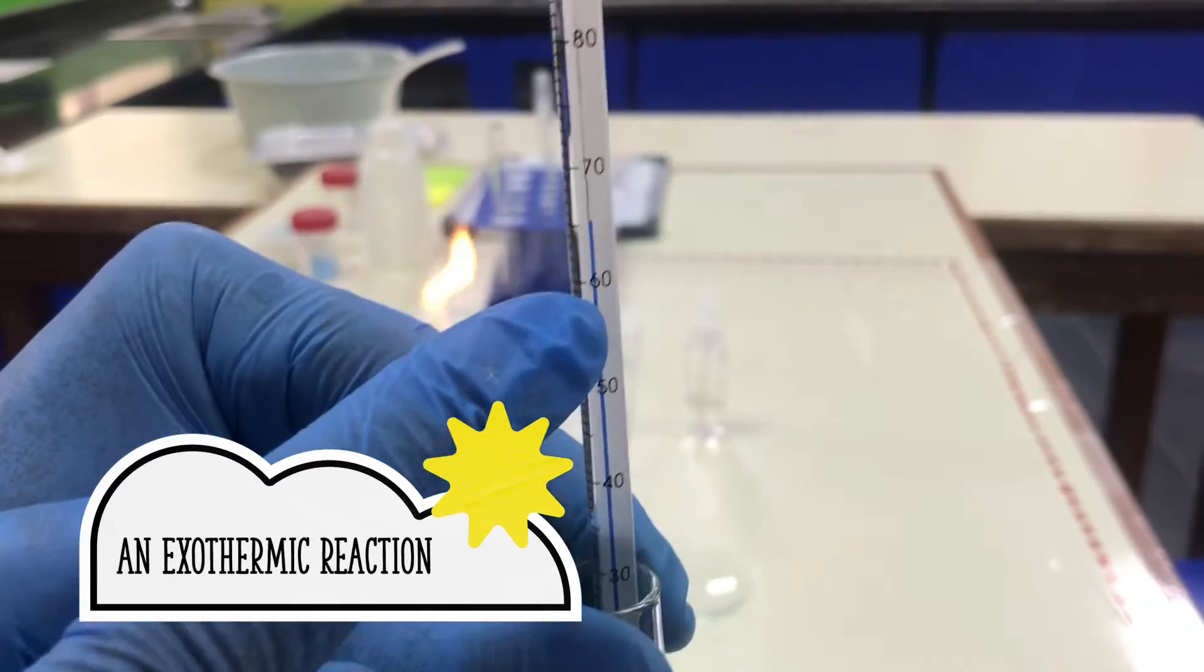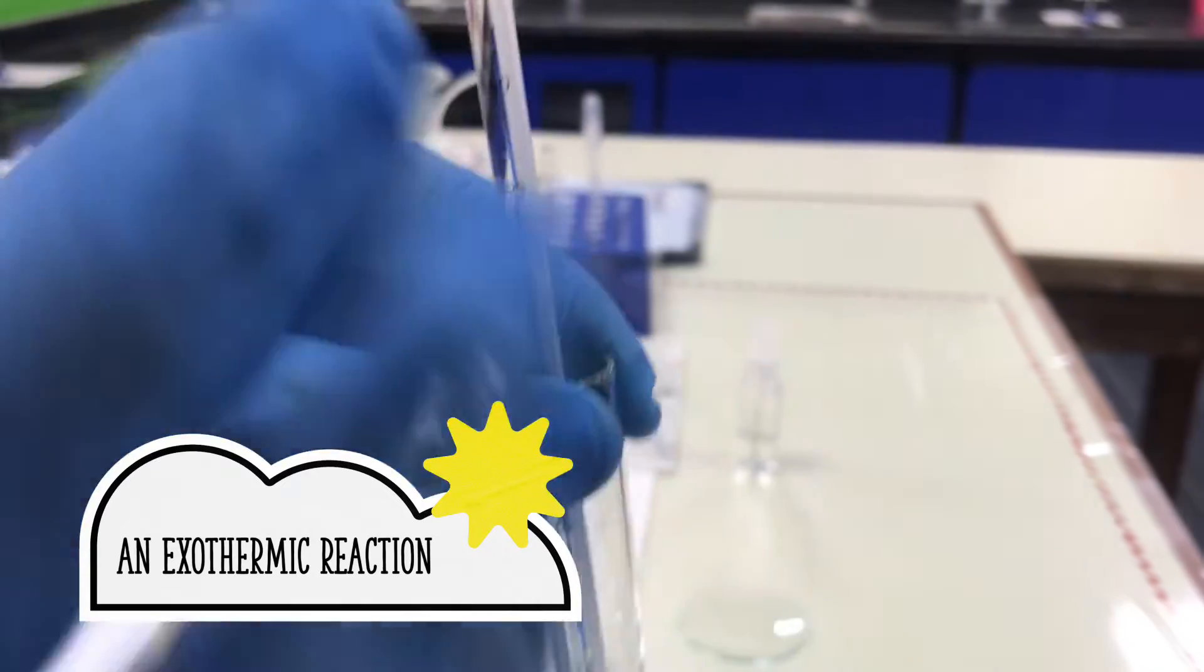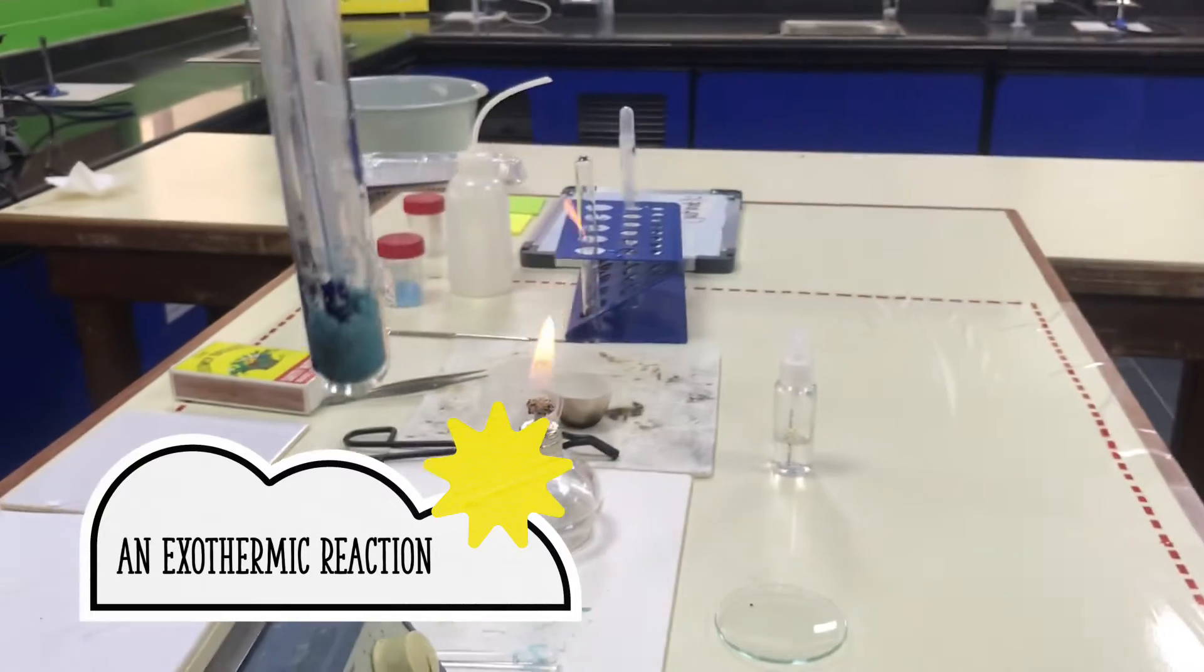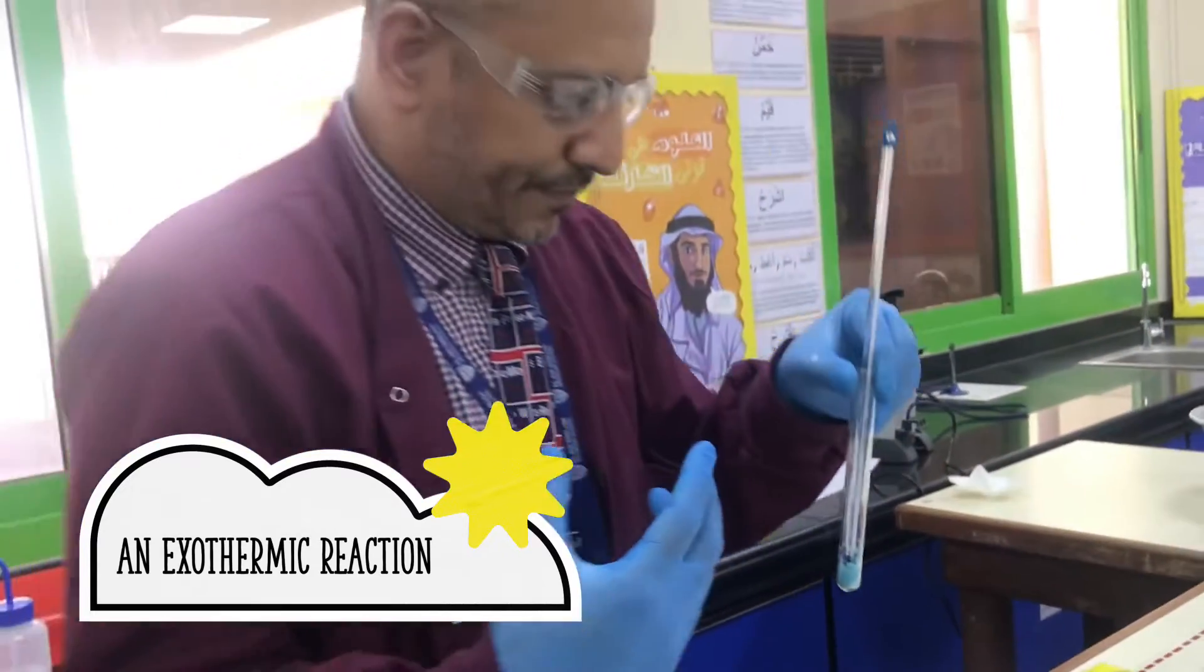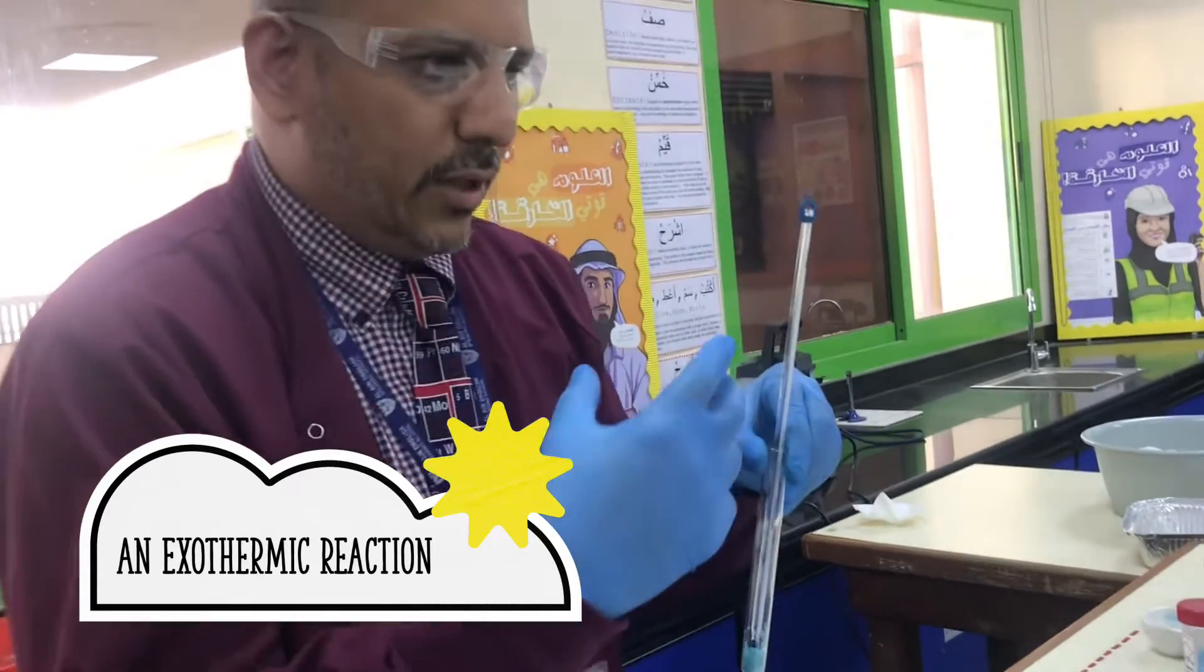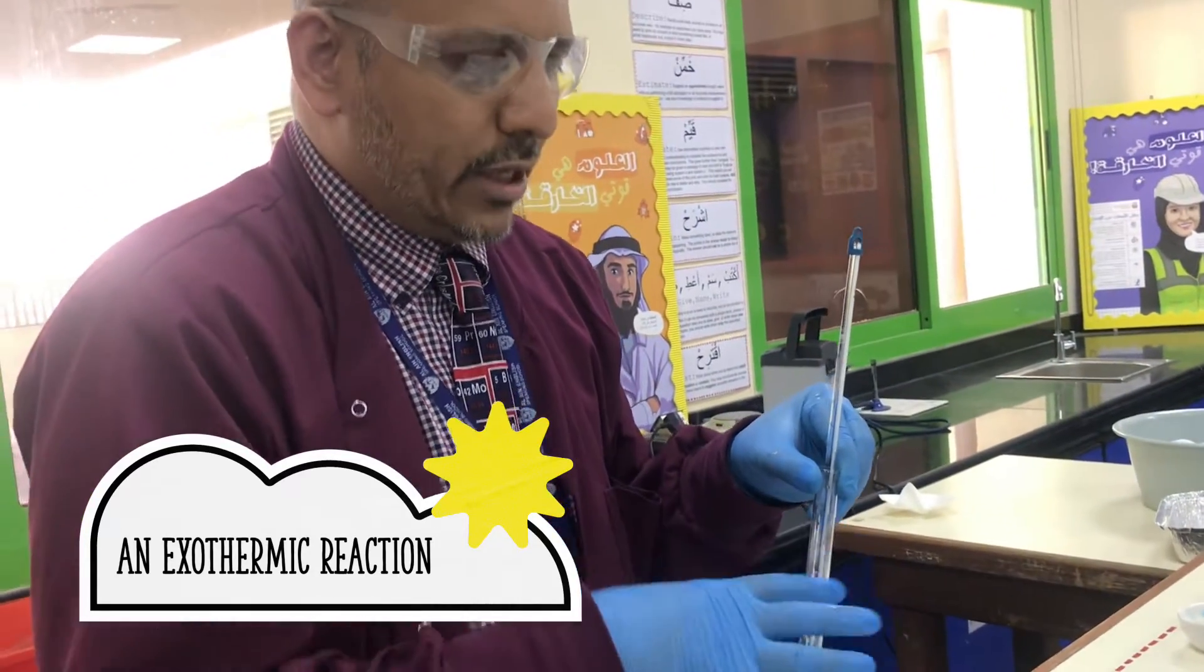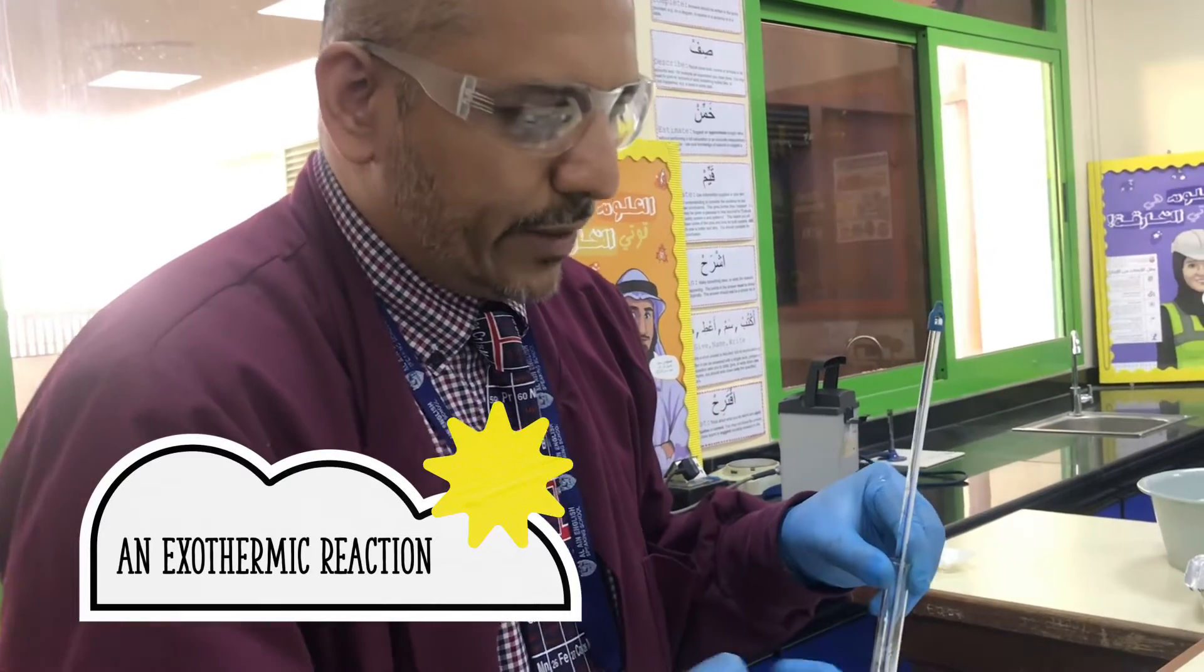So the reaction is over. The temperature is starting to come down again. So this is actually an exothermic reaction. The reason why it's an exothermic reaction is because we actually needed energy to turn it from hydrated copper sulfate to anhydrous copper sulfate.